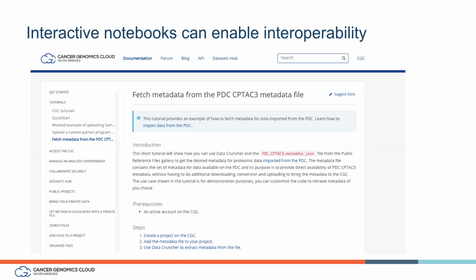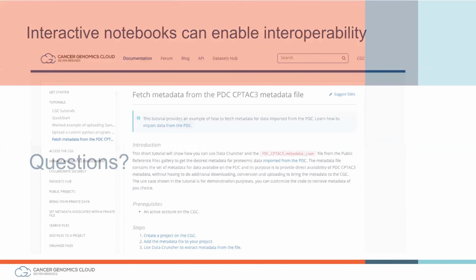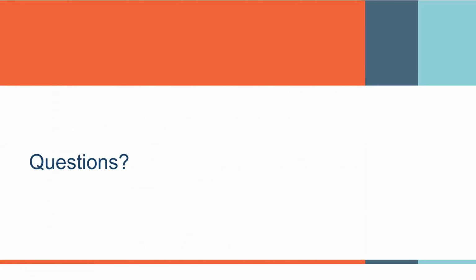So you can call APIs of other nodes, other places you might be working with through our notebook feature here. So that is the front end, and I can probably best to keep going and move on to the backend component now.